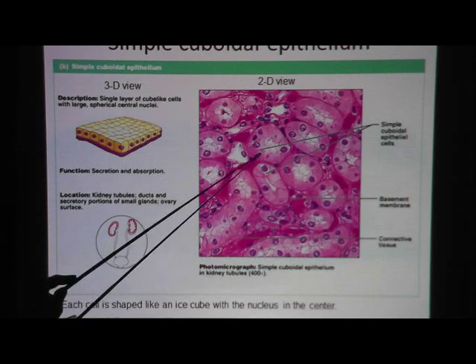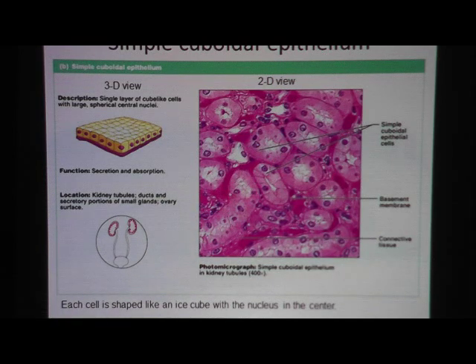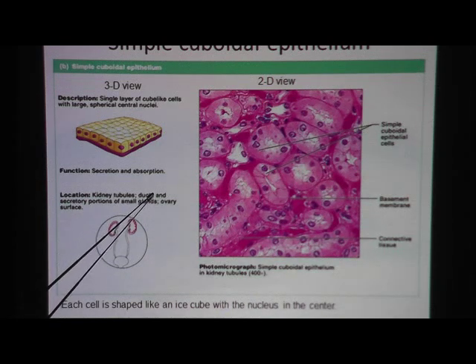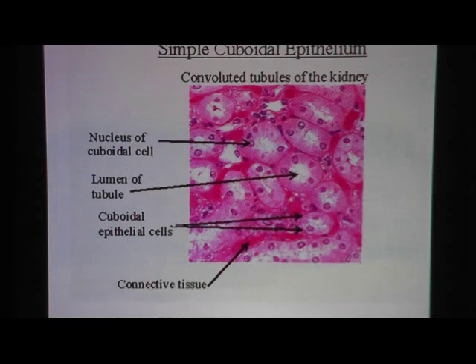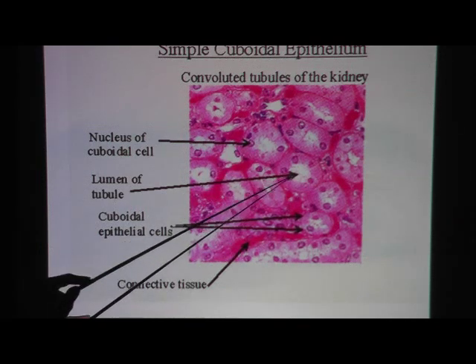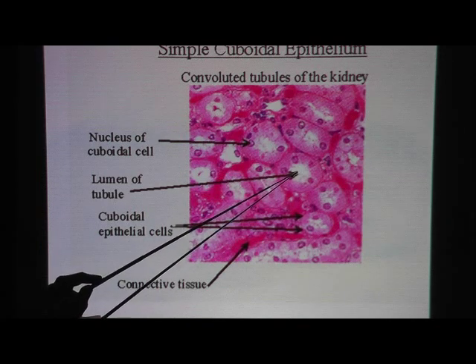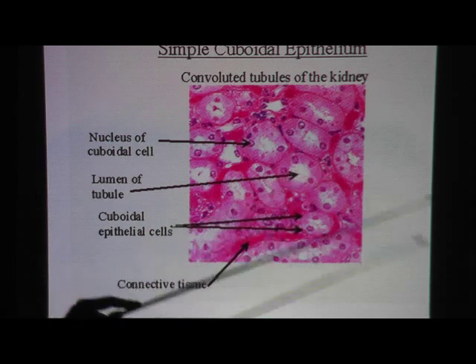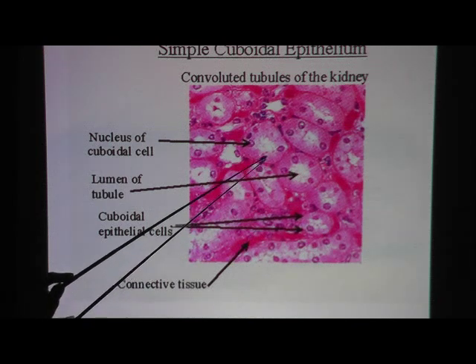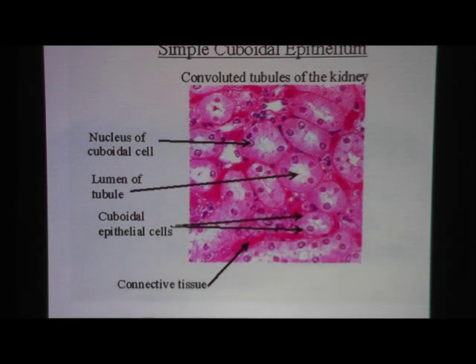You can also see the pink cytoplasm. In addition to kidney tubules, we also have simple cuboidal epithelium in the ducts of glands. Here's a similar picture showing the nucleus of a cuboidal cell and the lumen, which is the space inside the tube — that would be the free surface.